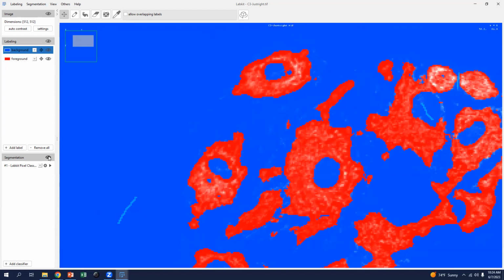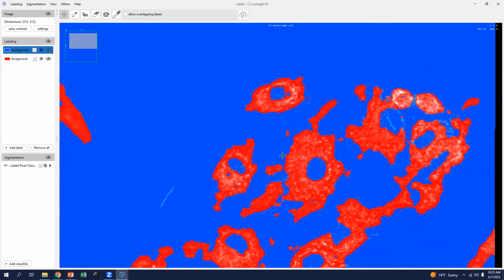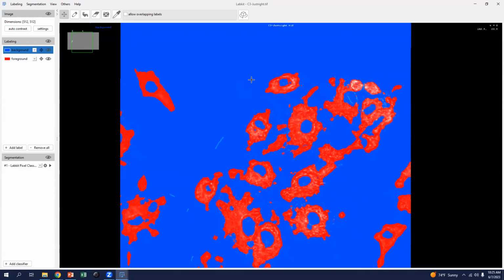Pardon? Experience. You need to. Yeah, it should be clear once you try it a few times and nothing seems to change. I think maybe around 10 iterations is typically enough to reach a good point. But this is a general machine learning algorithm, so it may not work well for all of your data. You may end up needing other machines or other tools to segment.